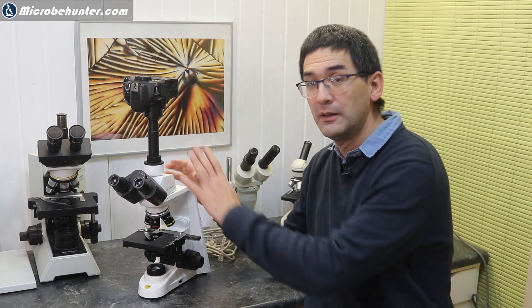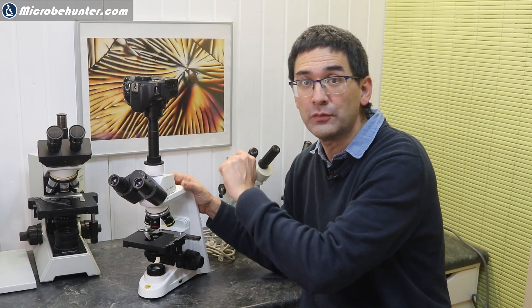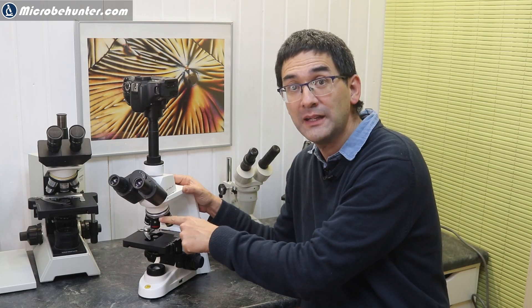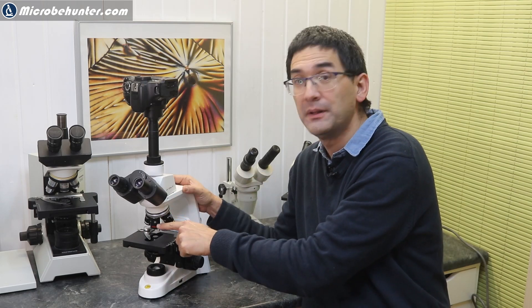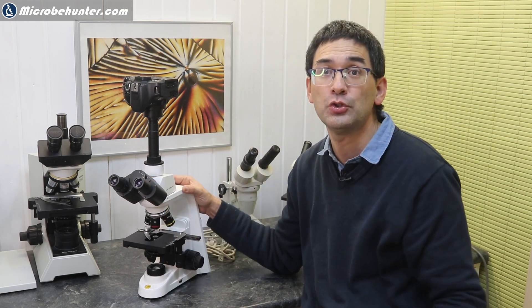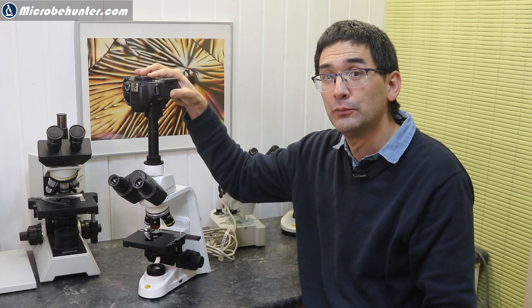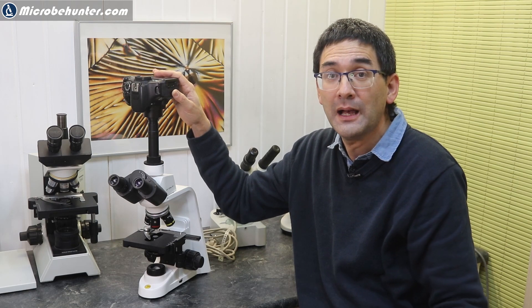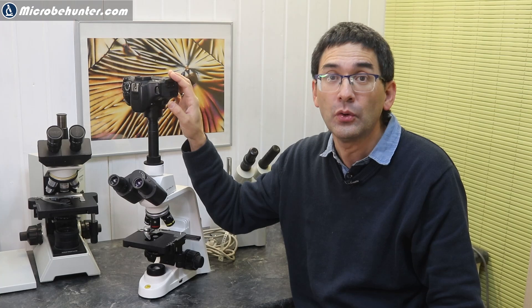So we all know that the magnification you get when looking through a microscope can be calculated by multiplying the magnification of the objective times the eyepiece. For example, in this case I've got a 4 times objective times 10 times eyepiece, which gives me a total magnification of 40 times. But when I take a picture with a camera, what magnification does the picture now have? You have to understand that the magnification when looking through the eyepieces is called visual magnification, and the magnification when taking a picture with a camera and displaying it on screen or in a book is called linear or lateral magnification. These are totally two different concepts.